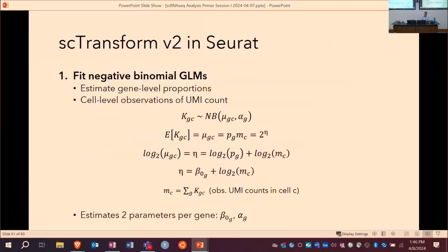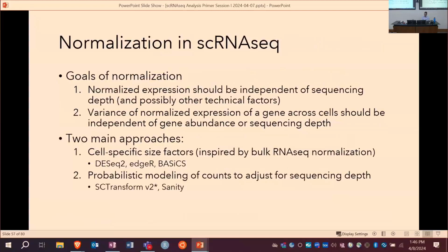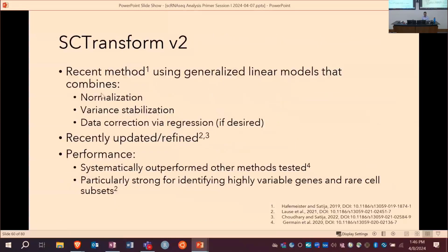Yeah, so I personally have not used the regular normalization function very much. They do point out, in this first bullet point, that the SCTransform actually does that. It essentially replaces normalize and VST. You would previously have run each of those in succession.